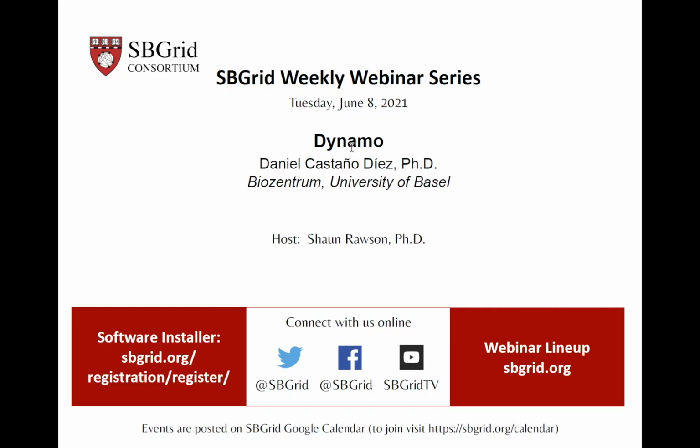It's going to be a really interesting talk today. We have Daniel Díez from the University of Basel, and he's going to talk about Dynamo, which is a package for tomography and subtomogram averaging in particular. And it's probably going to be the next big area in cryoEM, in my opinion. I think this is going to be the new frontier, and this is going to be where a lot of the interest and developments are going to come in the next couple of years. So it really is an opportunity to see where the field of cryoEM as a whole is going to go and where a lot of the new techniques are going to arise.